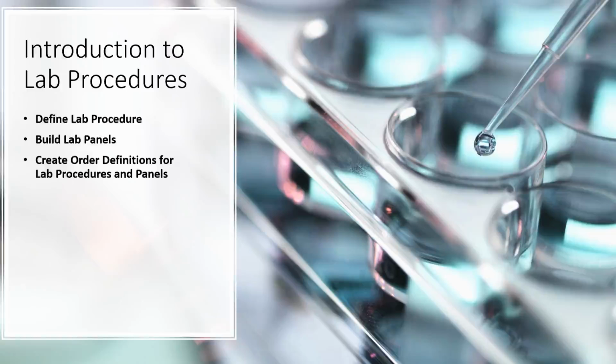Laboratory procedures are the core concept in the Laboratory Information Management System. They provide the basic information needed to identify and code the procedure, collect specimens, process tests, and bill for the procedure. Lab procedures can be ordered individually, or they can be combined to create lab panels.